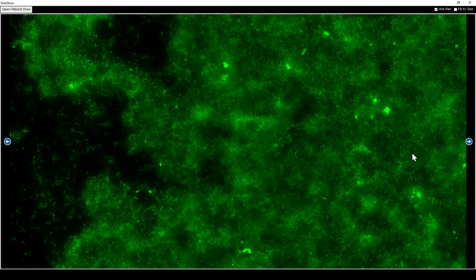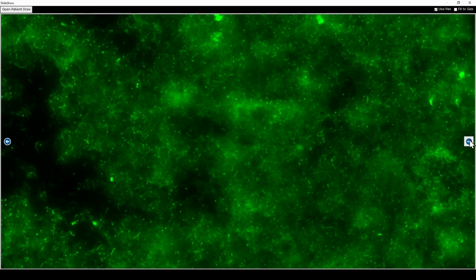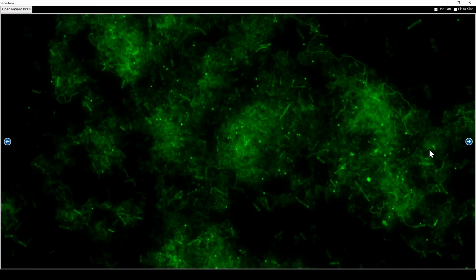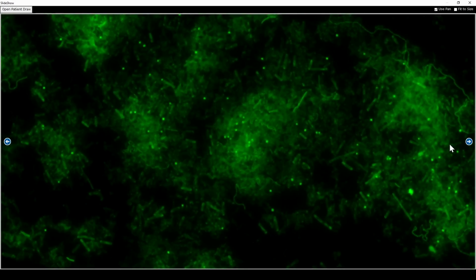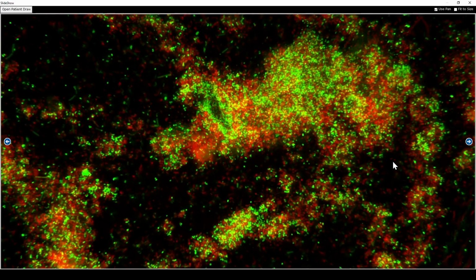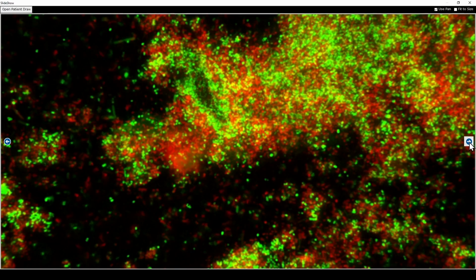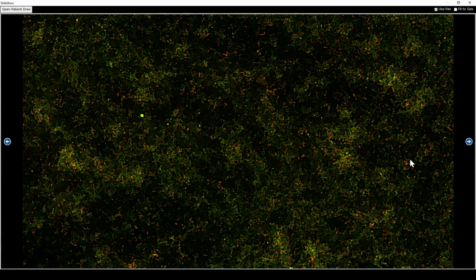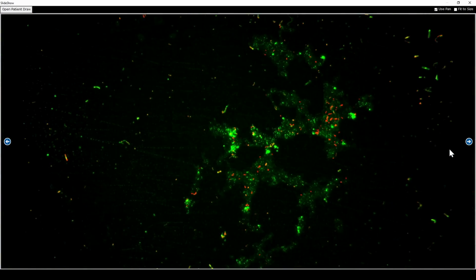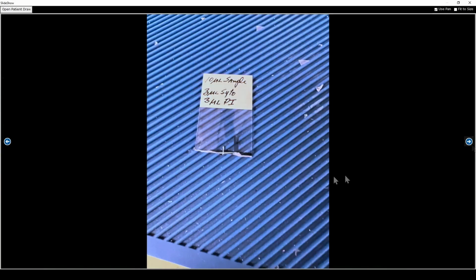And this is a biofilm grown on a glass slide, and you get a sense of the number of bacteria present. And here you can see another sample and the individual bacteria that are evident. This is a live dead example, and you can see bacteria that are both alive and dead in the biofilm sample. So we'll be using different stains to attempt to make the EPS matrix visible using confocal and fluorescent microscopes.